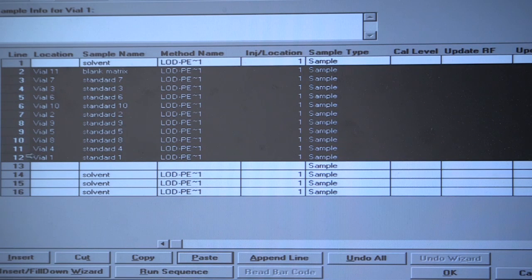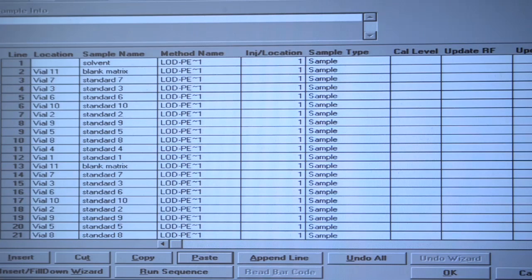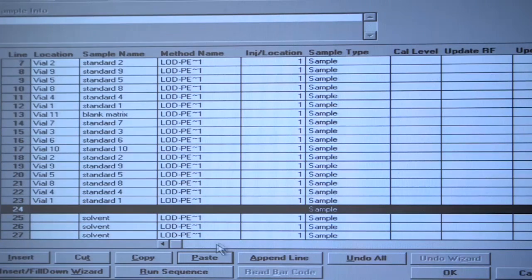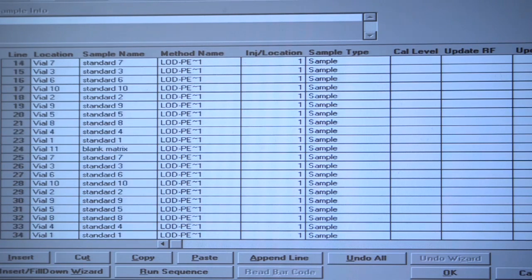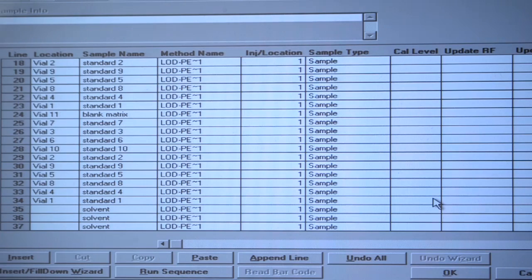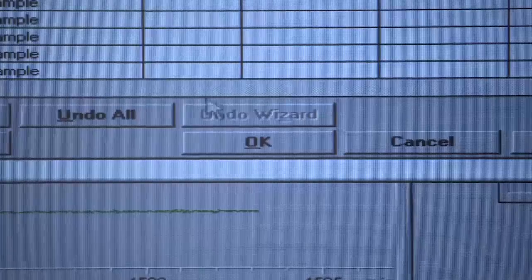And we will be analyzing all the samples three times. It is useful to analyze the samples in a manner as similar as possible to the real-life situation. It means if you have any other validation samples you have to analyze with this method, you can analyze them between those calibration samples. And now we are ready for analysis.